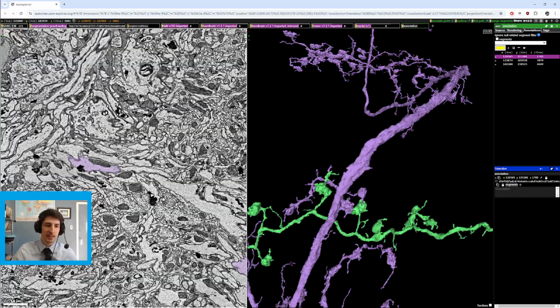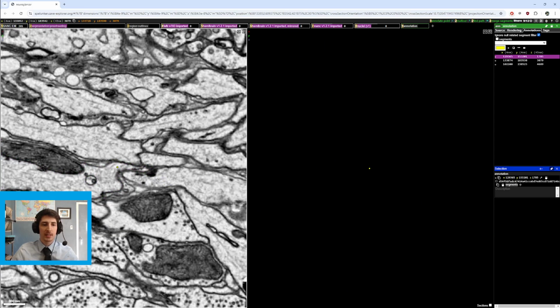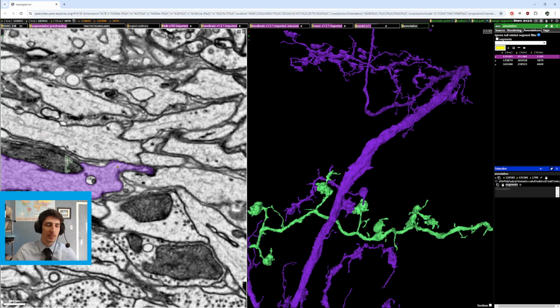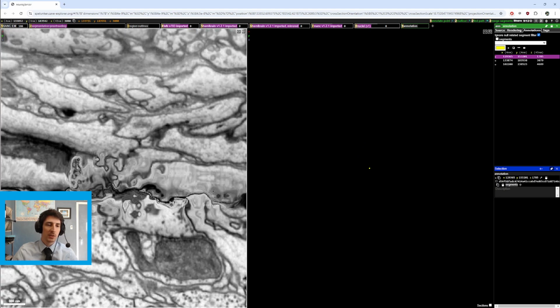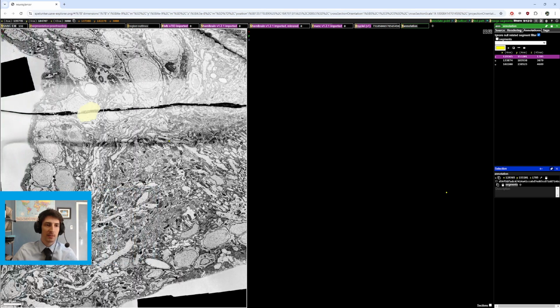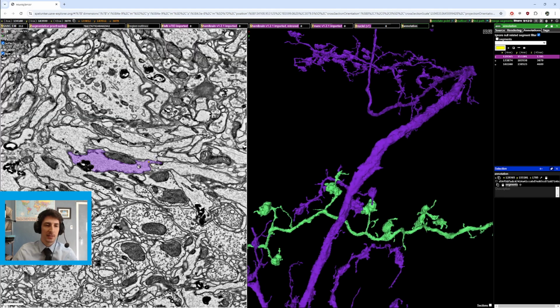And as you can tell, you can see the annotation point here. I'll zoom in. So right here, you can see, if I turn the segmentation off by hitting the number corresponding to the tab, so this is the segmentation tab, if I hit 2 on the keyboard, I can turn that off, and that helps me look at the 2D better. So you can see why this branch is missing. There's an error here in the data. It cuts across the whole thing. That error is much worse, but we are not looking at that at this time.